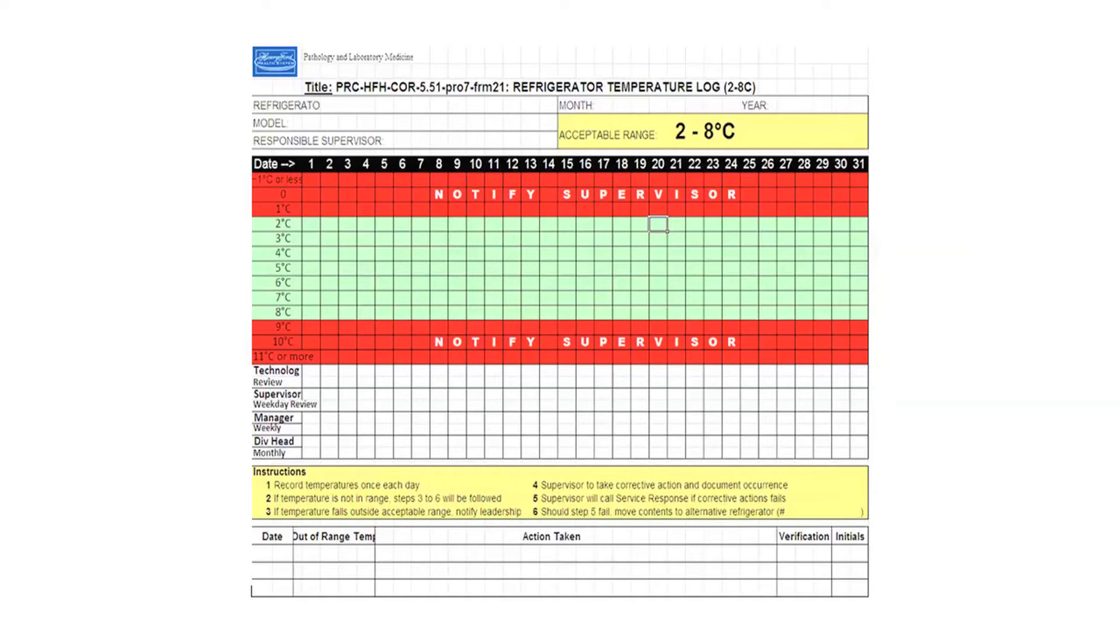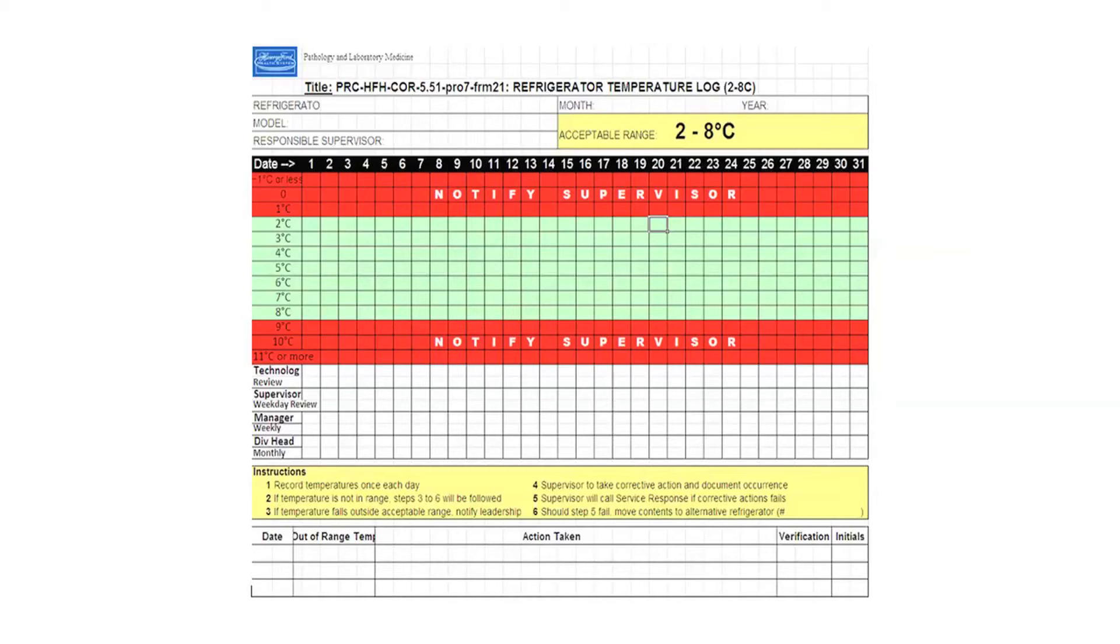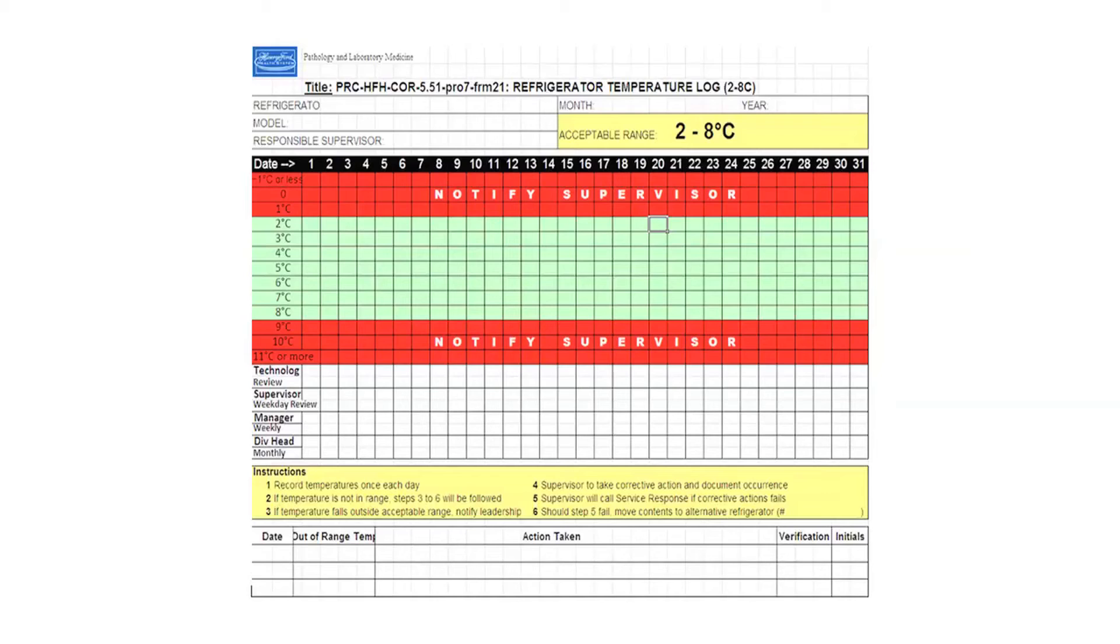The problem is the same. We have to track something over a long period of time and document whenever it is out of range. We came up with what you have on the screen—a color-coded temperature chart. It is a manual piece of paper with manual recording. The desired range, 2 to 8 Celsius, is on the left side. That's the temperature scale going from less than 2 Celsius all the way to more than 8 Celsius, and the desired range is in the middle.